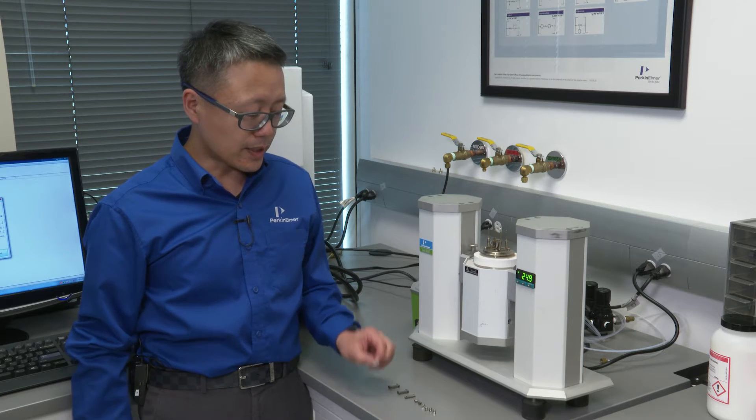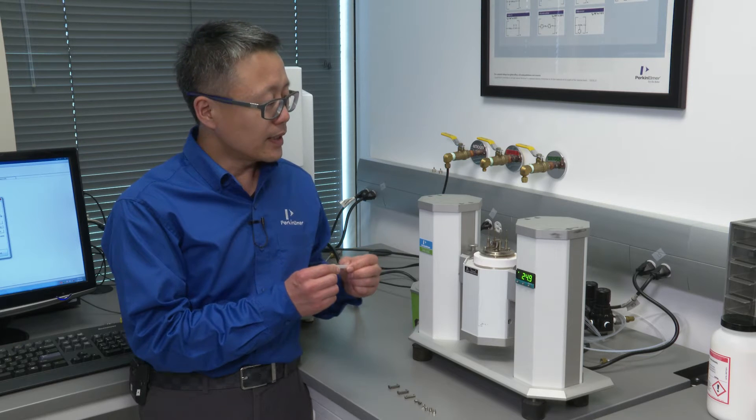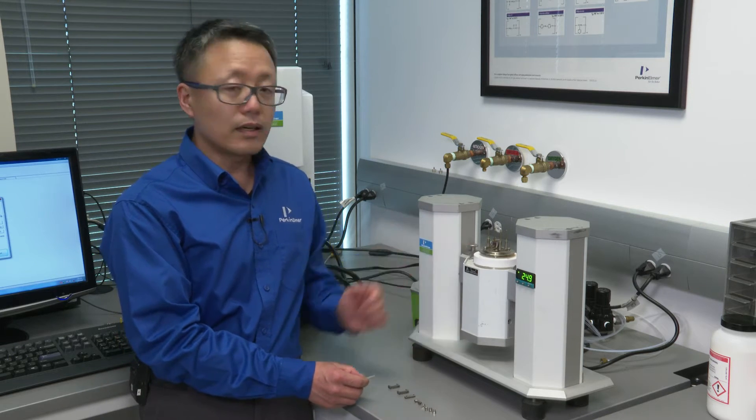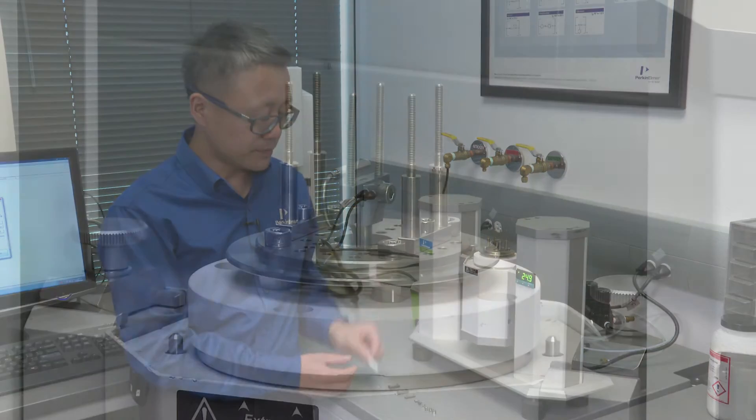This is an example for three-point bending. We usually make it into rectangular bars. I'm going to show you how to put these parts on the DMA8000 and run the material like this.